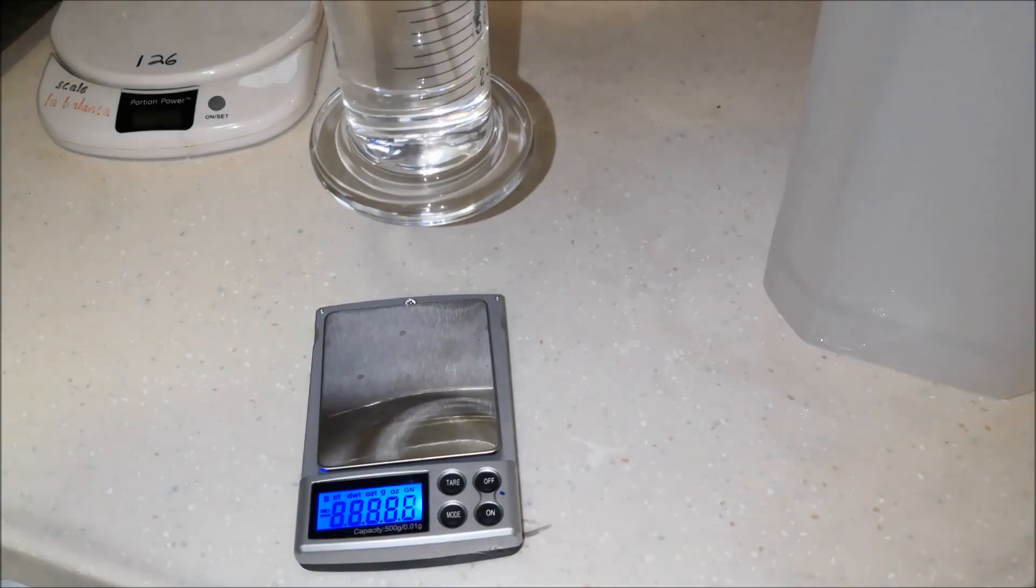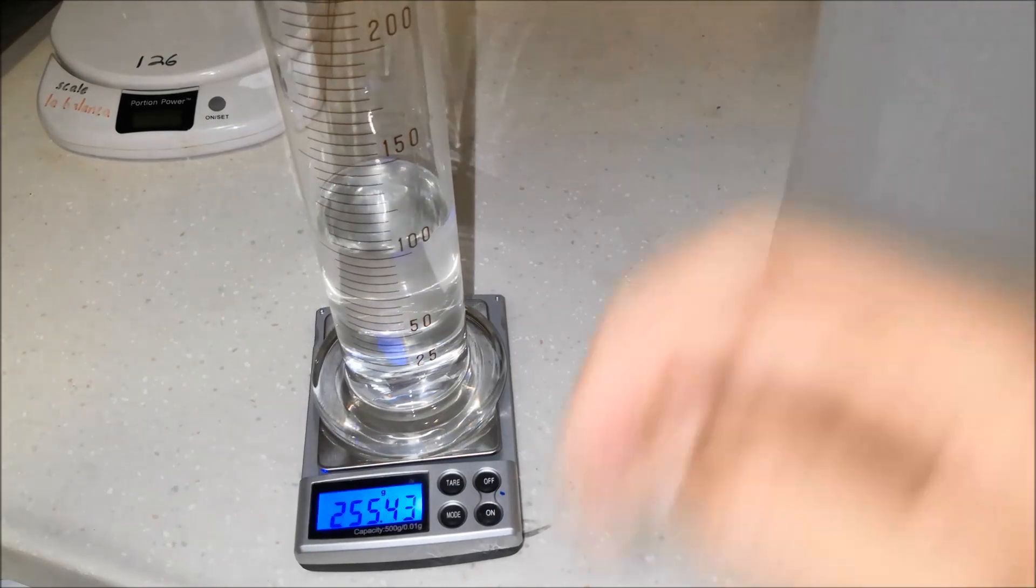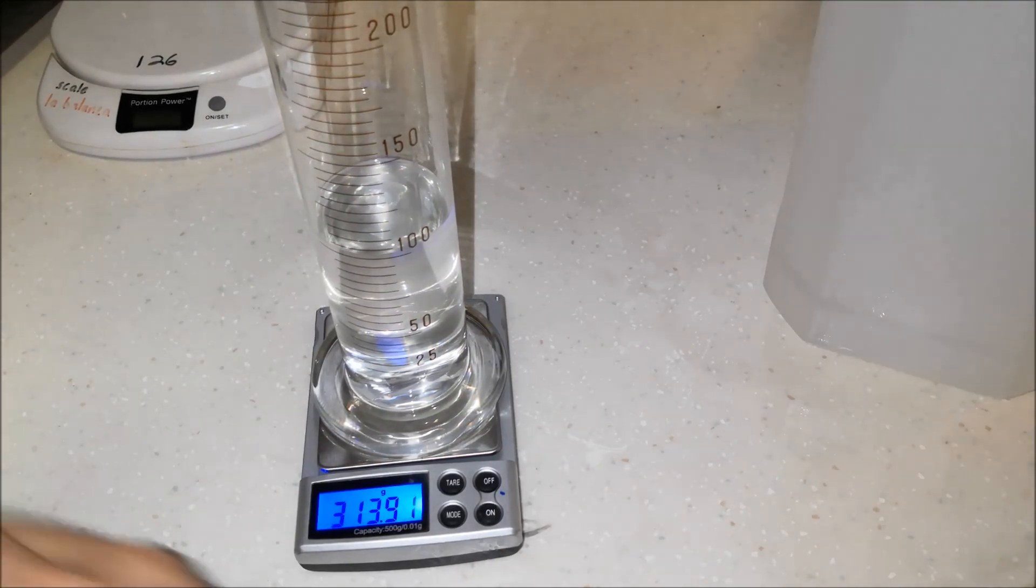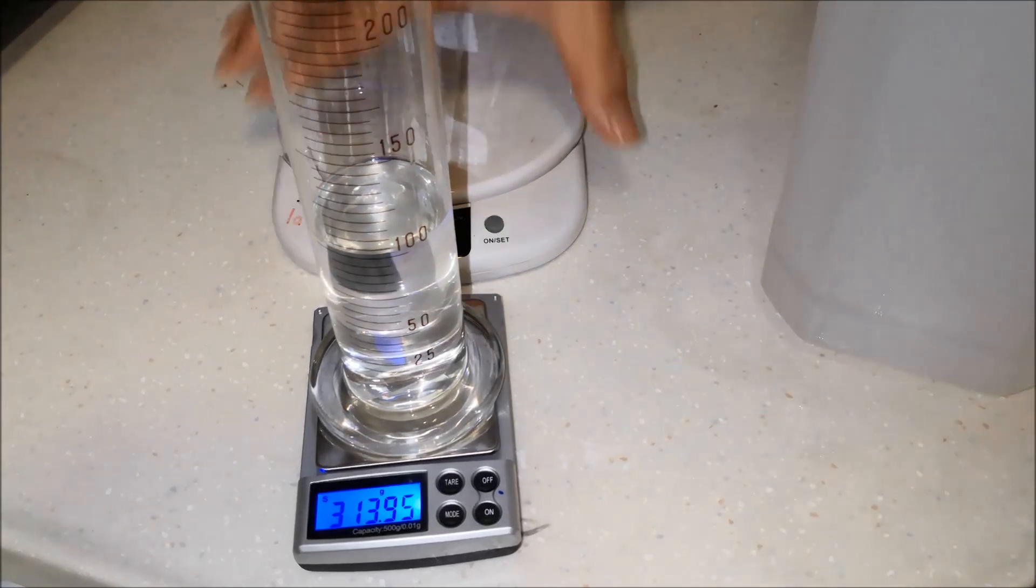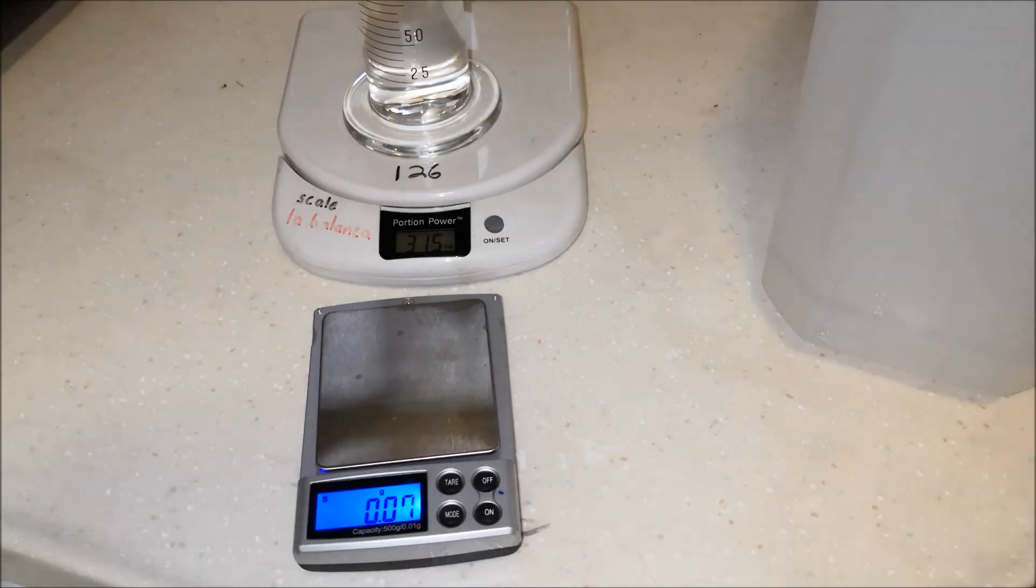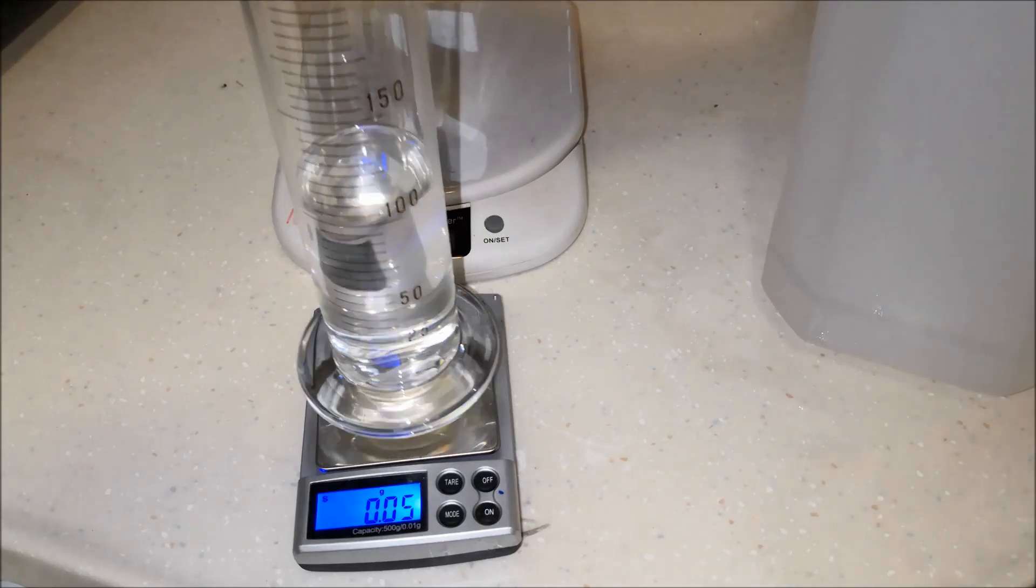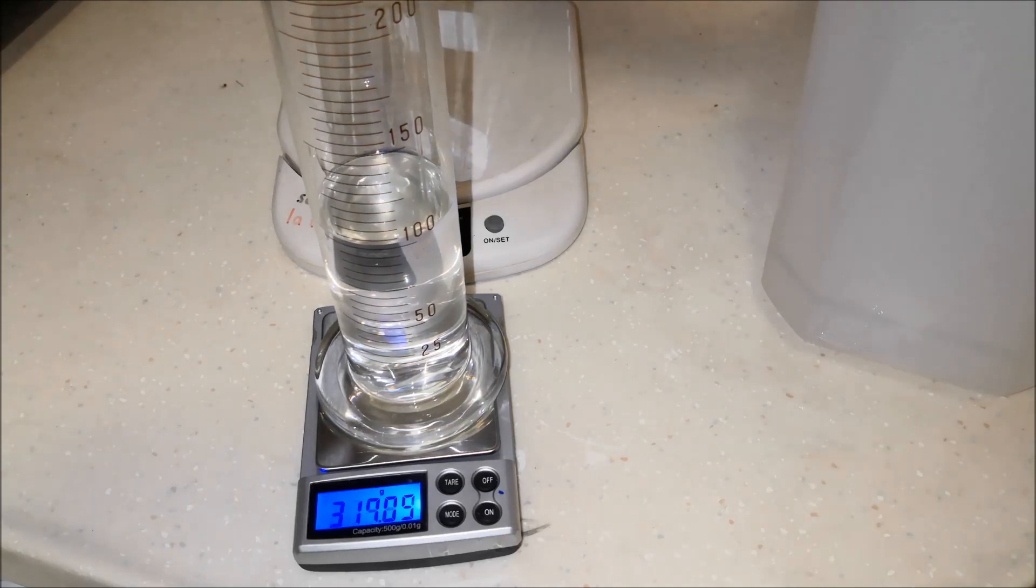We'll use the digital scale over here again. Let that zero out. Okay. Here we go. And it's telling us 313.94 grams. And we'll just cross check that with the kitchen scale. Which is telling me 315. That's probably within the margin of error. Let's zero this one out again. 313.89. Alright. So that's, again, within the margin of error.